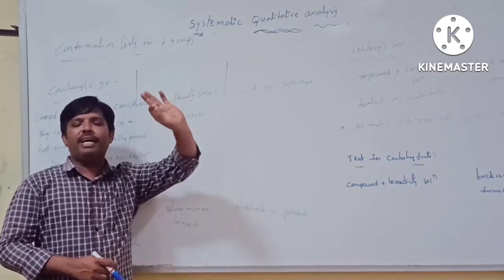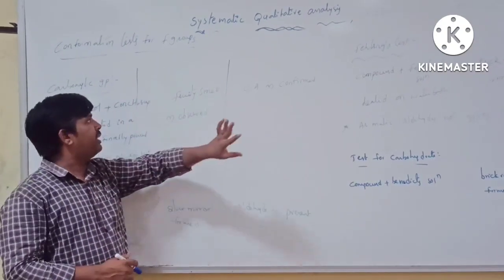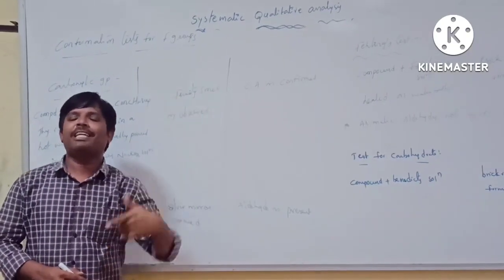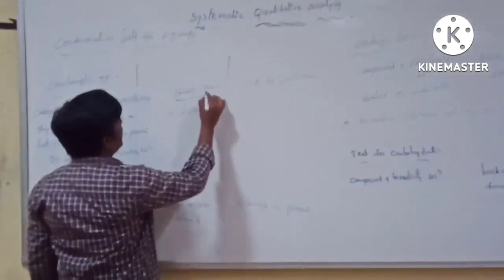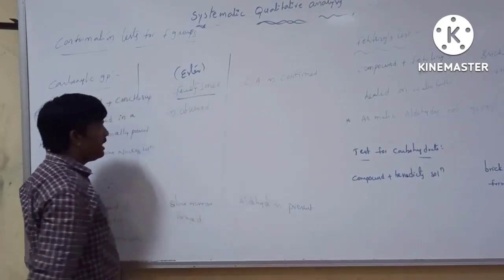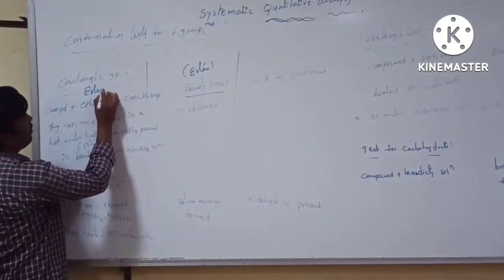This is the esterification reaction. The presence of fruity smell itself indicates the formation of ester. The fruity smell itself indicates the presence of ester. That's why this reaction is the esterification reaction.